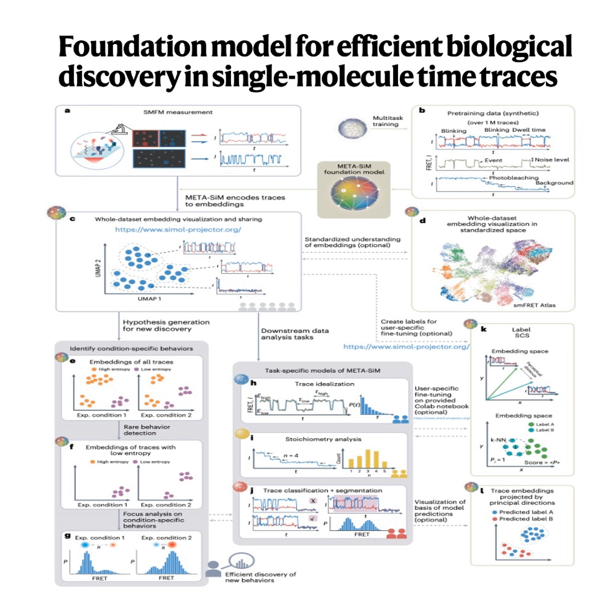So it's the model checking the human's work for consistency. Pretty much. If a trace you call type A is sitting right next to a bunch of traces you call type B in the embedding space, the model flags that. Its SCS score will be low, maybe below 0.8, which is the suggested threshold. So an SCS below 0.8 suggests maybe I made a mistake in my labeling, or my categories aren't defined very well. Exactly. It points to potential human errors or inconsistencies in how you're analyzing or grouping your data. It's a tool to help standardize your own manual analysis process. That's clever. Okay, that's quality control.